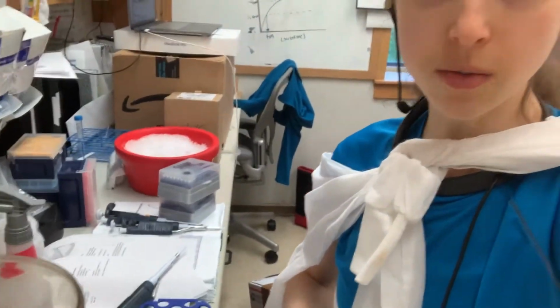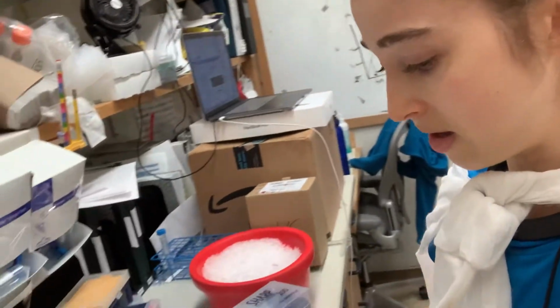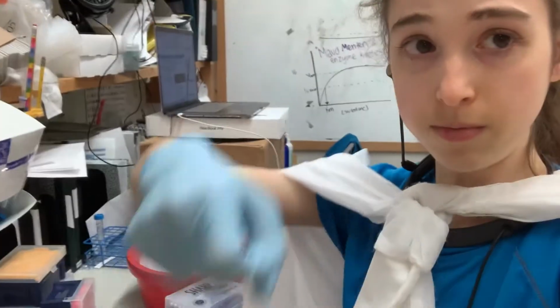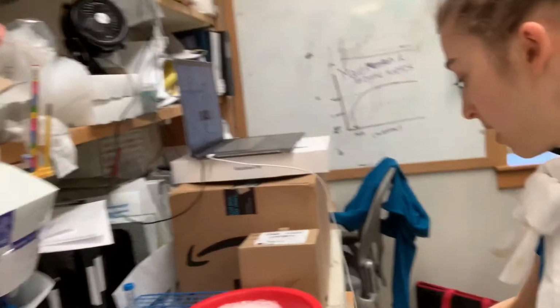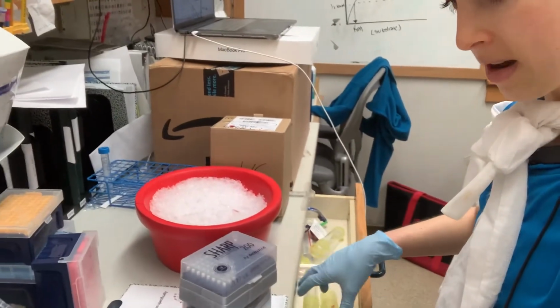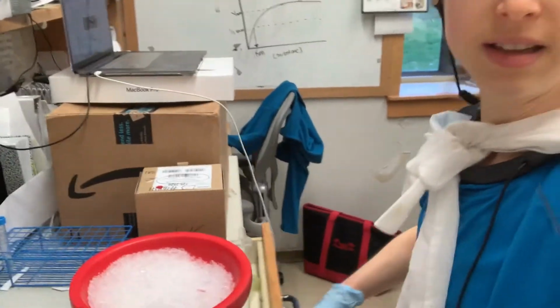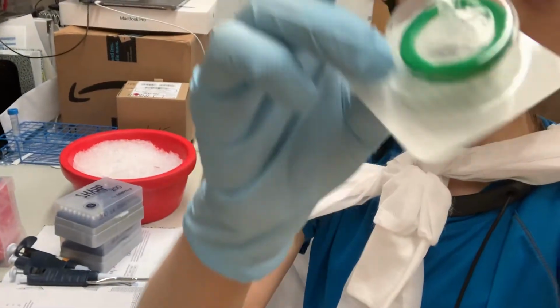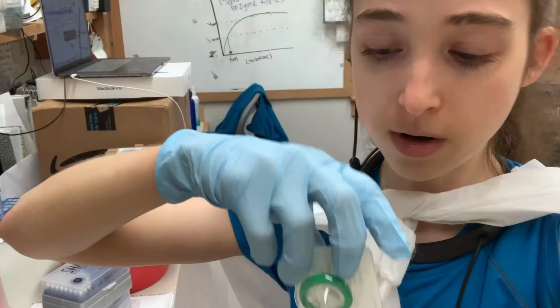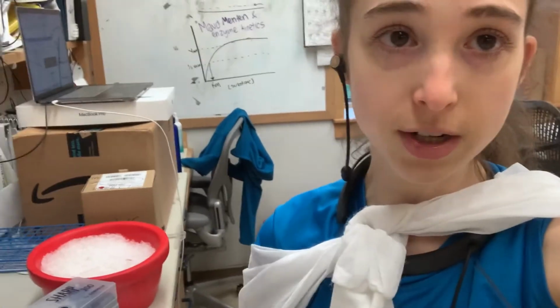For some solutions, when you don't have as much volume, what I use is a syringe filter. So we have a syringe, you pull up your liquid, and then use a filter. We have different size filters for these. Typically when I'm doing an antibiotic or something like that, a smaller portion, I do a 0.2 filter. I typically use the 0.2 filters for various little solutions. And when I make those things, I can store them in the freezer.